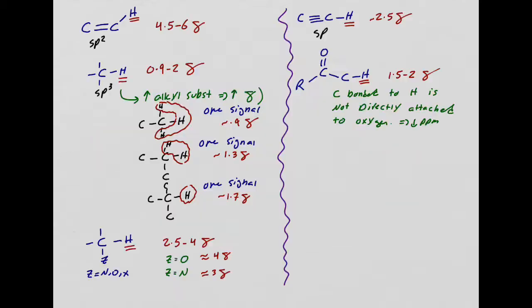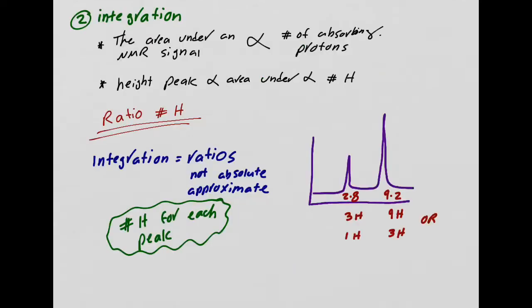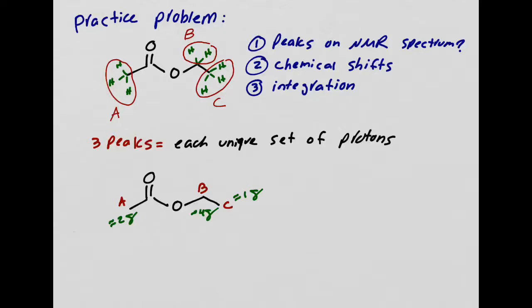You can see over here, let's come over here. Again, it's just a CH3 attached to a CH2, right? But there is that oxygen nearby, so I'm going to say it's probably around 1 ppm. So right here, CH3 attached to one carbon, but again, that one carbon is attached to oxygen, so maybe like around 1, maybe 1.1. That's where I would expect the chemical shift to show up. So far, so good? Okay. Beautiful job. All right, so that's not bad.